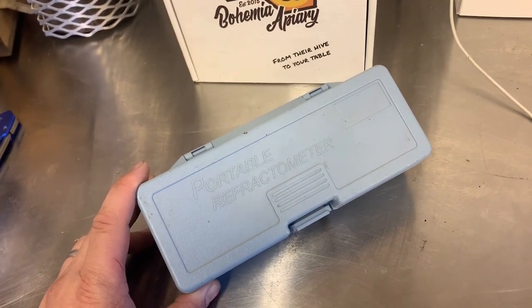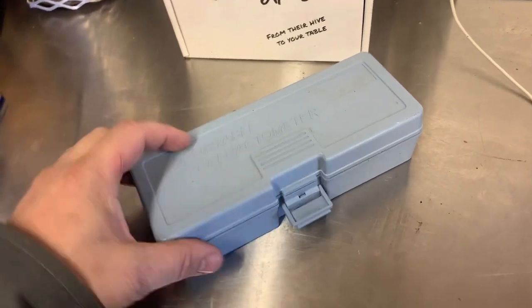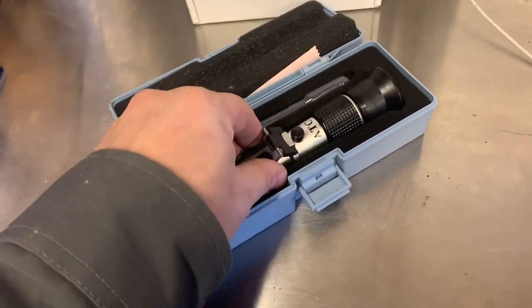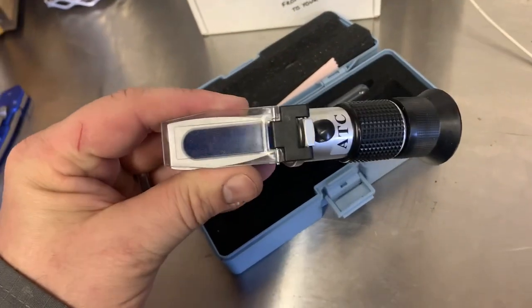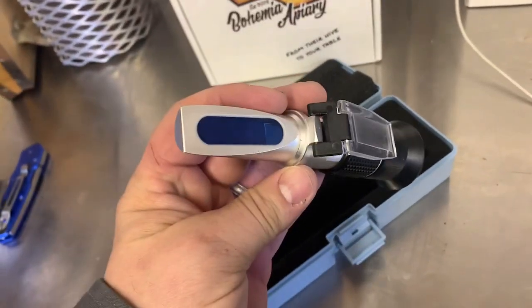It measures how much moisture content is in that particular bit of honey that you have. It looks almost like a little magnifying glass with a flat end and a cap that goes over top.